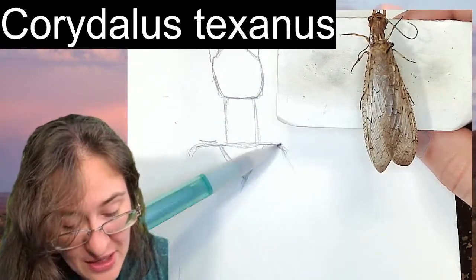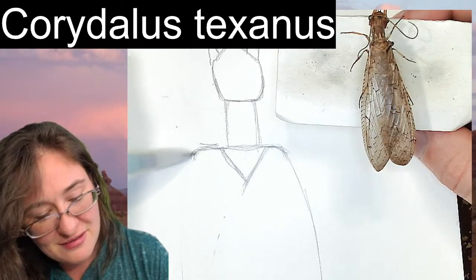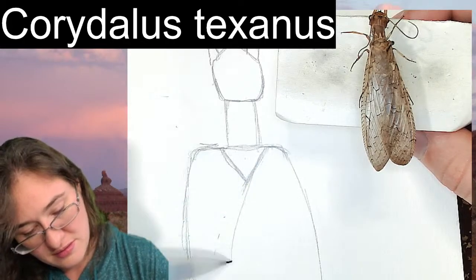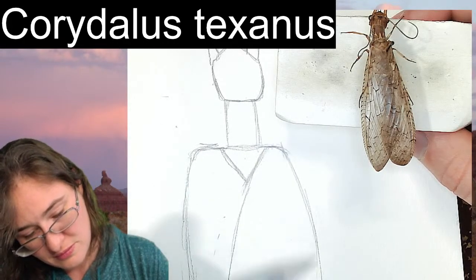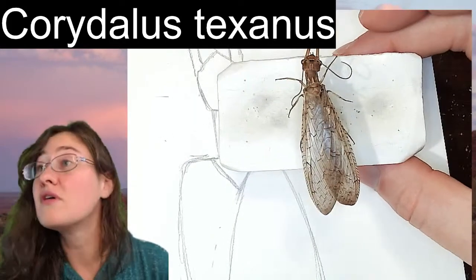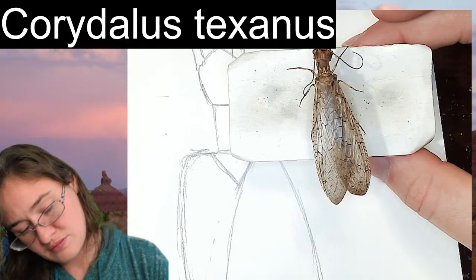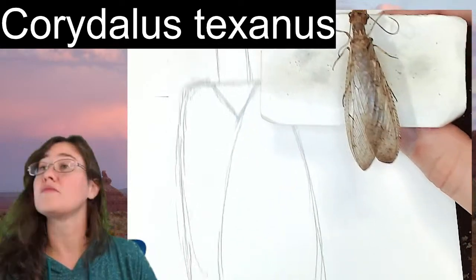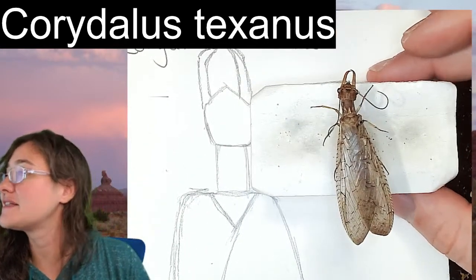My wings here, they don't want to be that long. And generally, the wings do separate like that at the end.